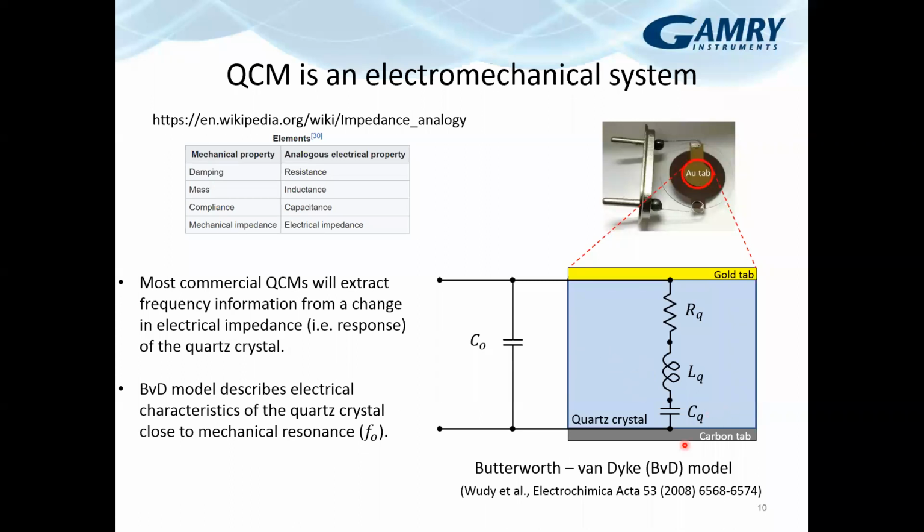And the capacitance, you can think of it kind of like a spring, I would say. And so you have the ability to store energy, and that's often called compliance. You may have also heard of it in terms of elasticity.